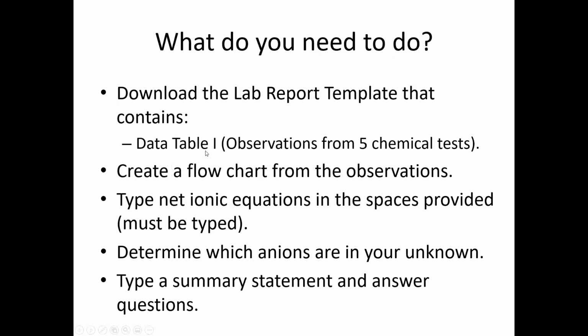You will need to download the lab report template and create a flow chart, type all the net ionic equations in the places provided, and determine the ions in your unknown. There is space for you to type a summary statement and answer some questions in the lab report.